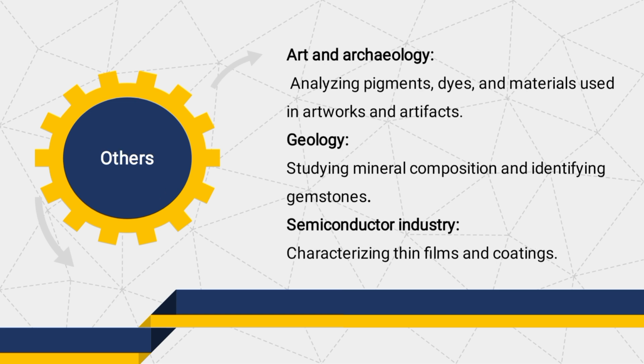Other applications include art and archaeology. FTIR can analyze pigments, dyes, and materials used in artworks and artifacts. In geology, it helps in the study of mineral composition and it can also help to identify gemstones. In the semiconductor industry, it is used to characterize thin films and coatings.